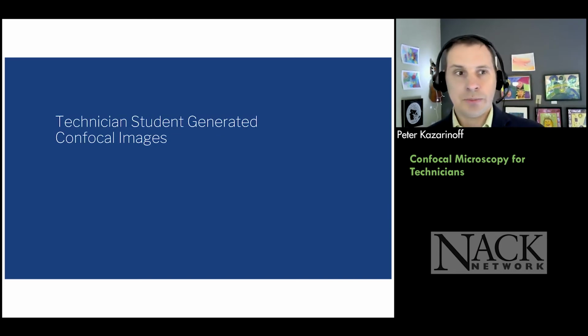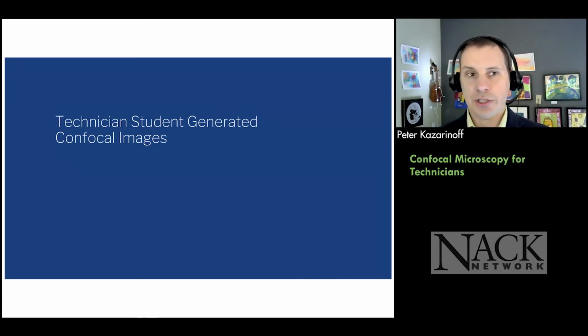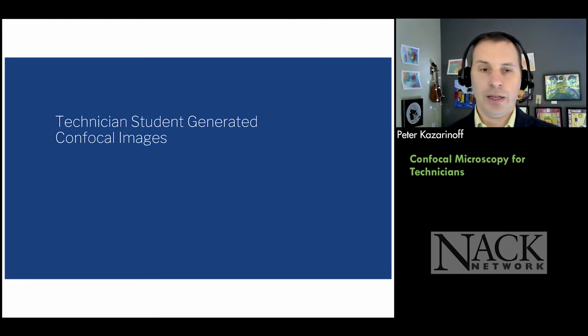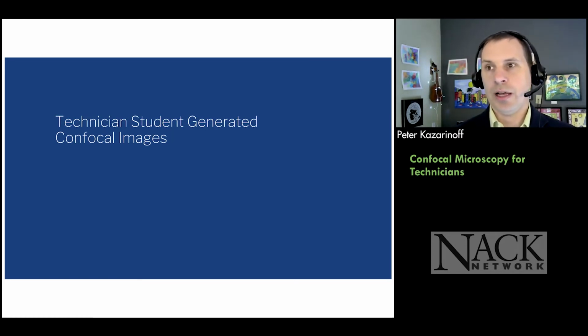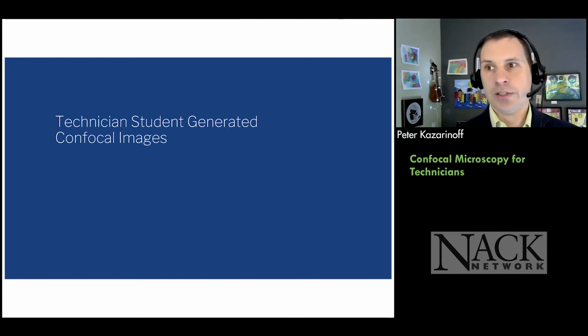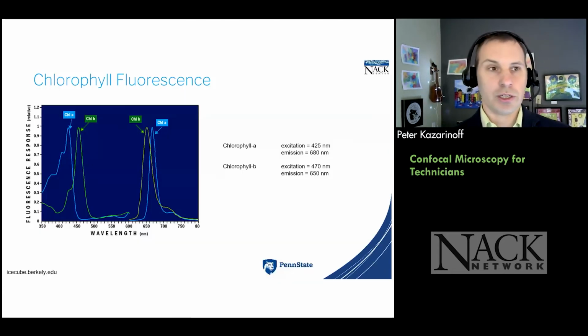So next, what I'm going to show is basically showing off the students' work. These technician students were able to make some amazing laser scanning confocal images, and also make images that were in applications that were important to them personally. So next I'm going to show a couple of 2D images and then move on to talking about some 3D images and how those were collected.